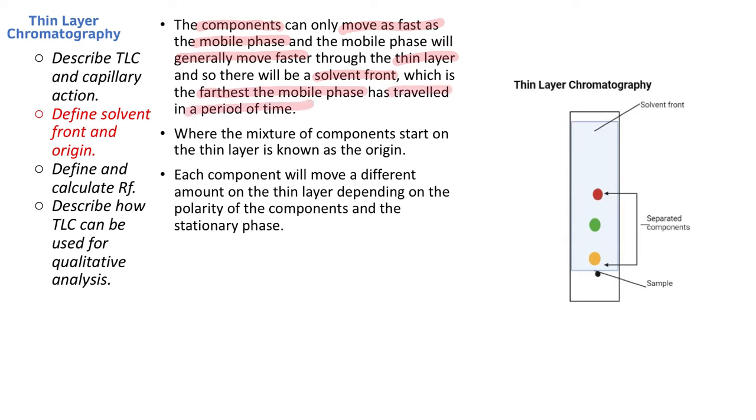Okay, so what's happened here on this side is that this is a piece of paper or a thin layer of silica gel, right? They put a sample as a dot there. If it's paper chromatography, you might put your marker pen dot there, okay? And then they've dipped this end into water, and so the water has moved up through capillary action.